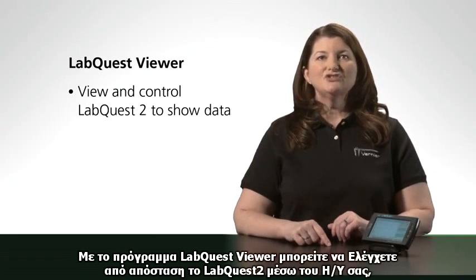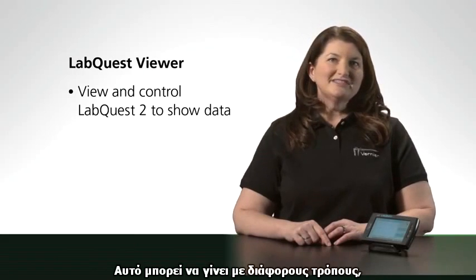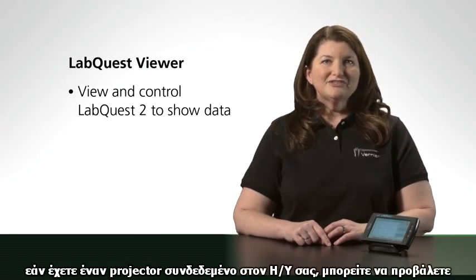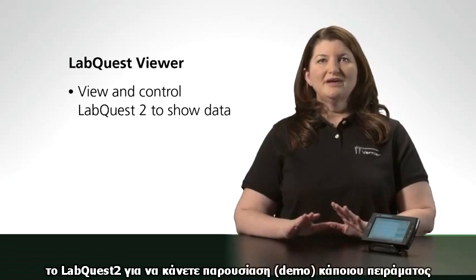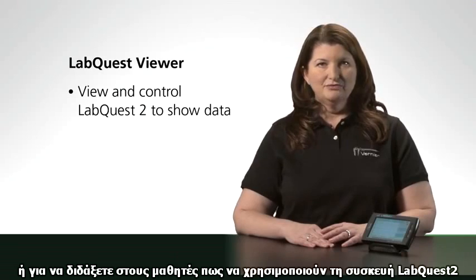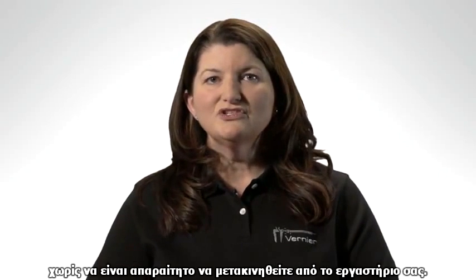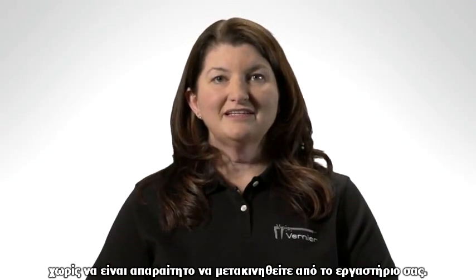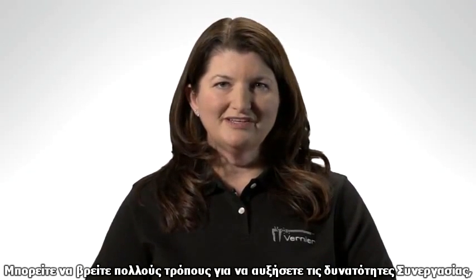Finally, our new LabQuest Viewer allows you to view and control LabQuest2 directly from your computer. You can use this in several ways. If you have a projector connected to your computer, you can project your own LabQuest2 as a demo or as a way to teach students how to use a LabQuest2. You could also share class data by projecting from a particular student group without them having to leave their lab table. You'll find many ways to increase collaboration using LabQuest Viewer.